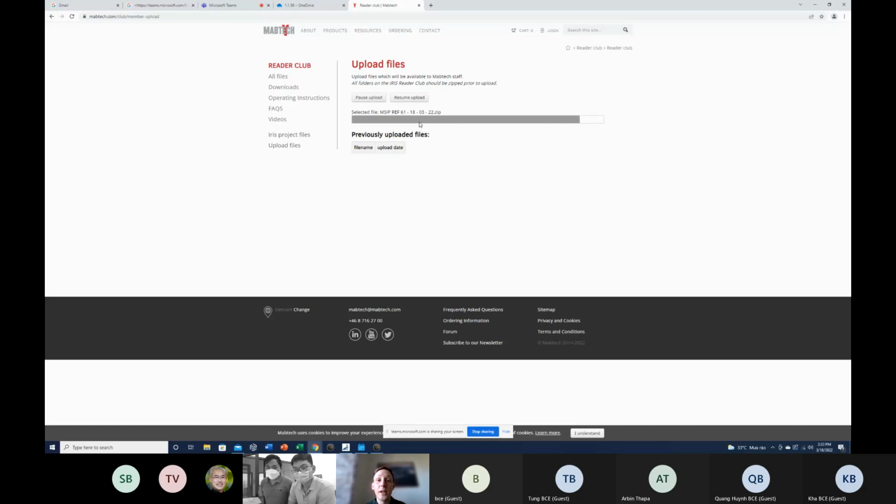Okay. But in the future, today I will go through an installation training, a presentation, so that you understand the process. And we will also in the future schedule a service training so that you get trained on what to think about when analyzing different things in the installation process and in the service process.